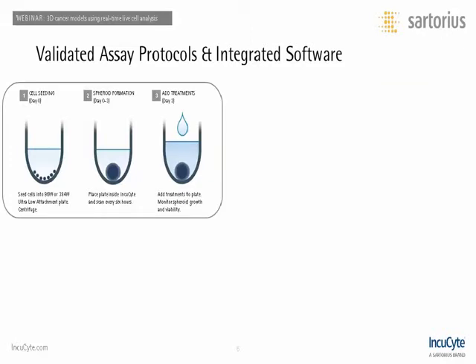Now, you may be very familiar with the several published approaches to generating single spheroids, but here I will just focus on the formation of single spheroids in ULA round-bottom plates. The schematic shown here describes a validated protocol for the formation and treatment of single spheroids in not only 96-well plates, but 384-well plates.